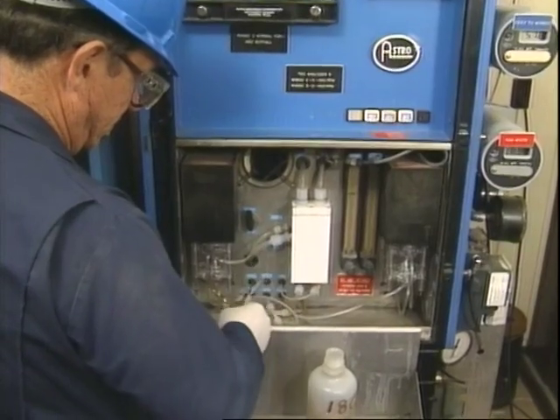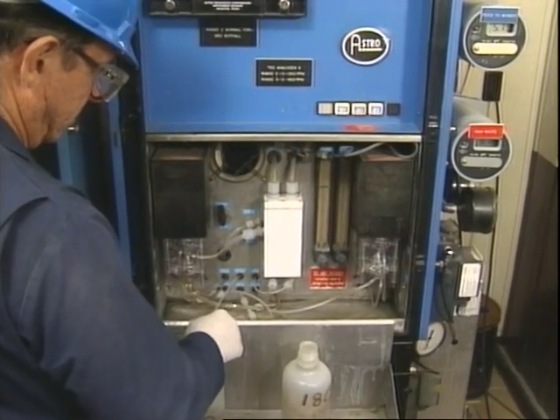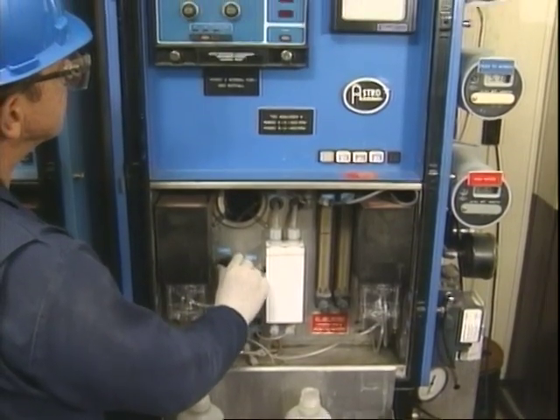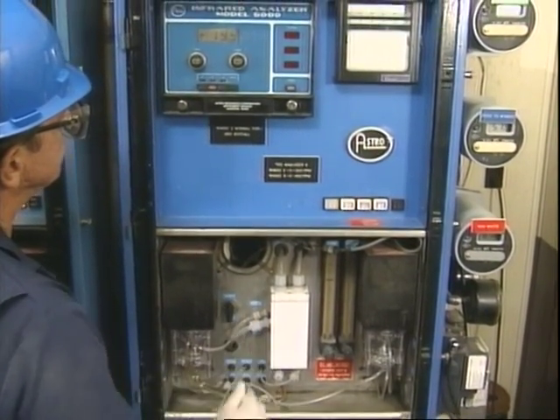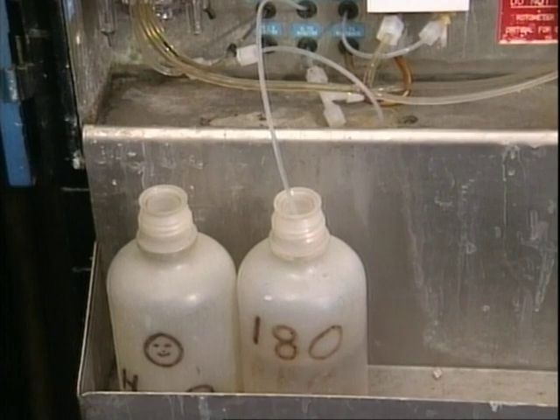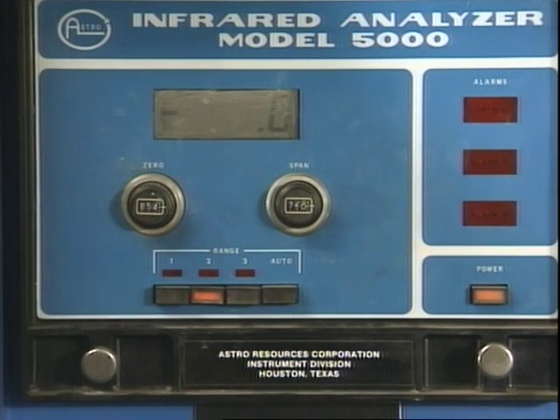To zero the analyzer, introduce a sample of known concentration that is transparent at the wavelength of interest. It can contain either a mix of pure components or the average background stream without the analyte of interest. In either case, calibration samples can be bottled samples which have been certified as accurate or validated in the plant lab. Introducing the zeroing sample should produce a zero concentration reading at the analyzer readout.